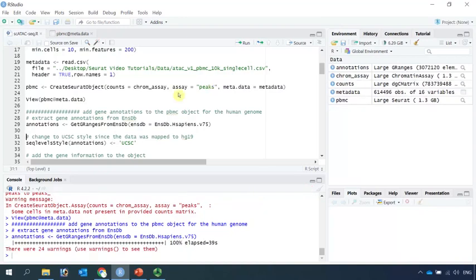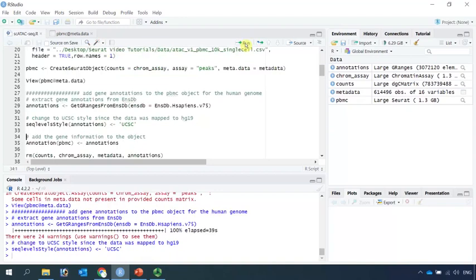Next we can annotate the data using Ensembl human gene database. Because the data was mapped to human genome 19, we need to change it to the UCSC style. Now, we can annotate the data.